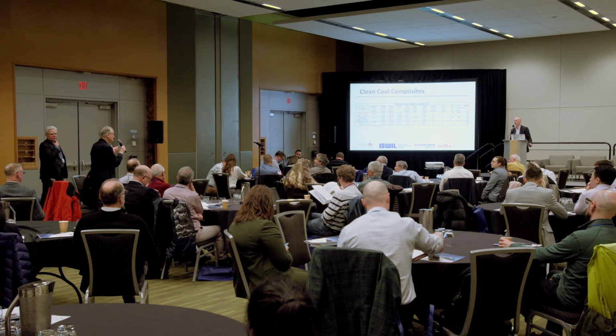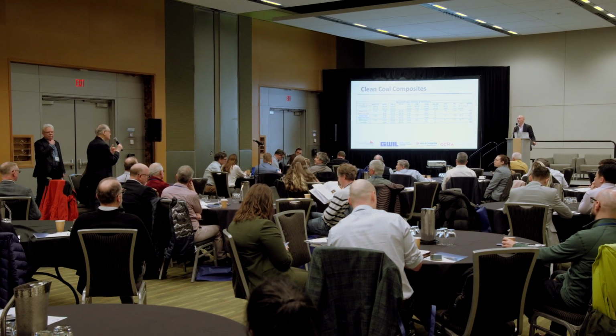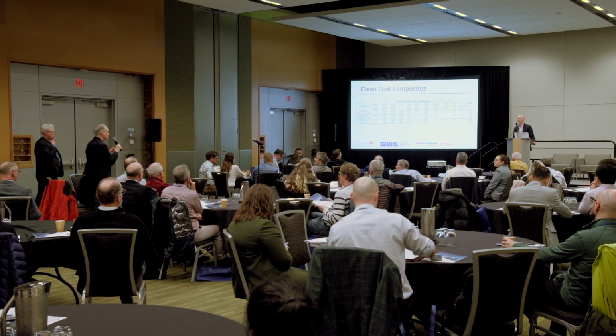Yeah, thanks, Dave. Hi, Jason. I'm always happy to learn something new. That's the highest CSR that I've seen with the lowest dilatation. I don't know if I missed this at the start. Did you tell us which coal this was? It originated from the Elk Valley, I will say.